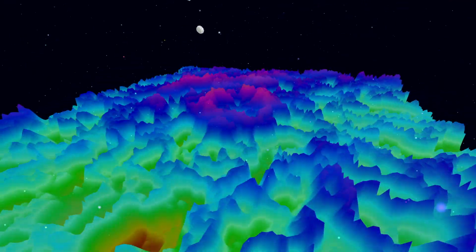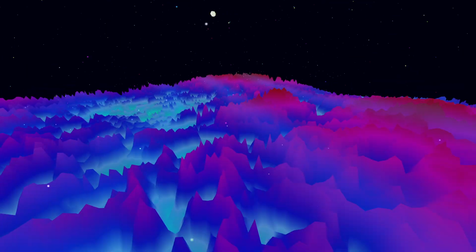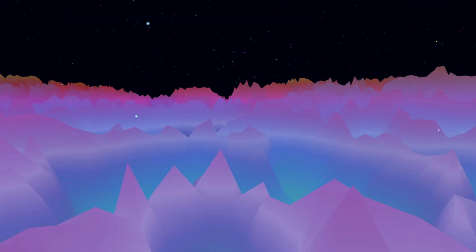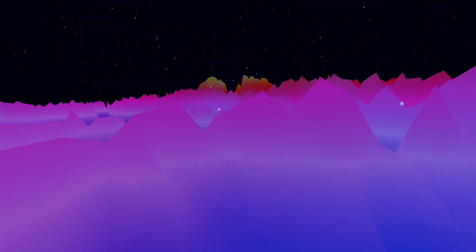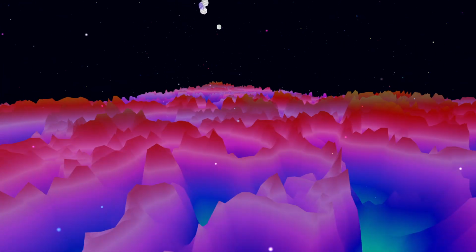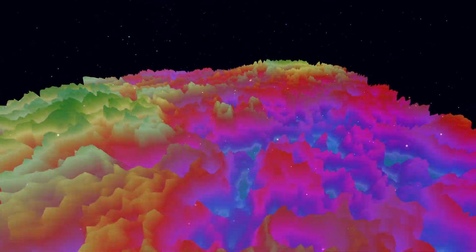PES. Think of it as a way to shine a special light on something and almost instantly figure out what atoms are inside and, even cooler, what their electrons are up to. That's a great way to put it, yeah. If you ever wonder how scientists really figure out what makes a new material tick, maybe for batteries or solar cells, PES is often one of the first tools they reach for. It's like getting a peek under the hood at the atomic level.